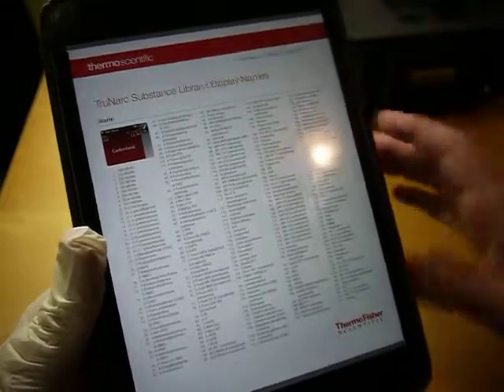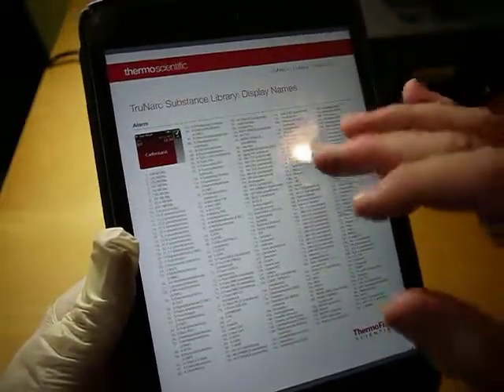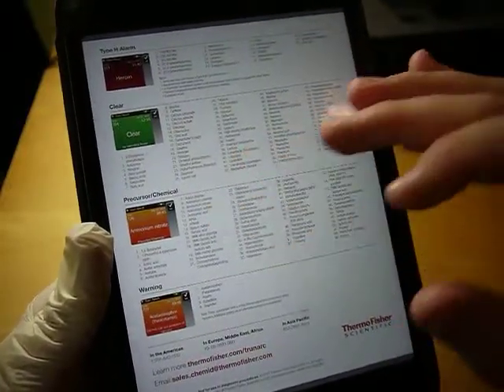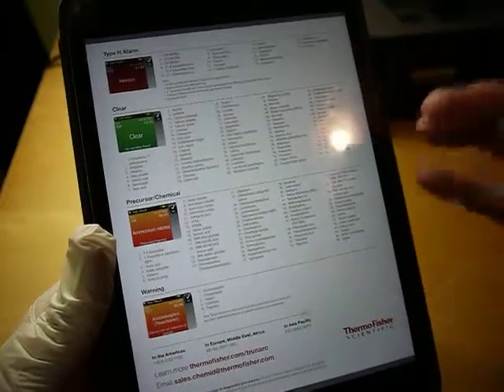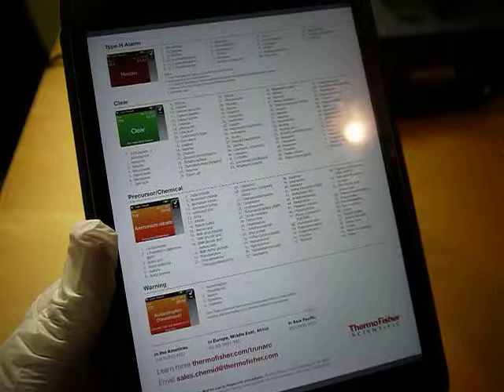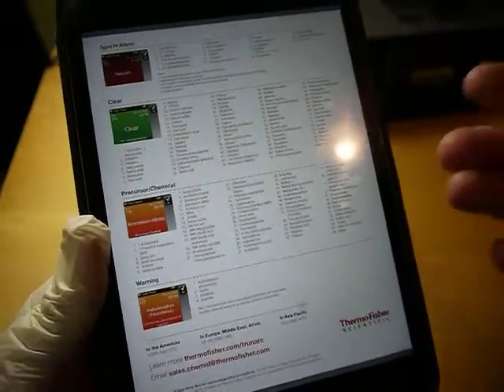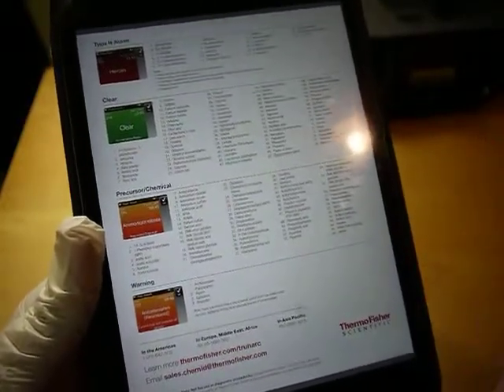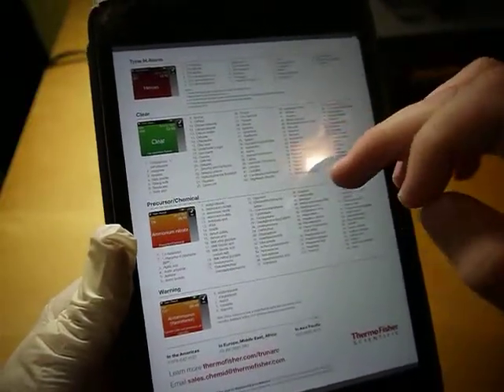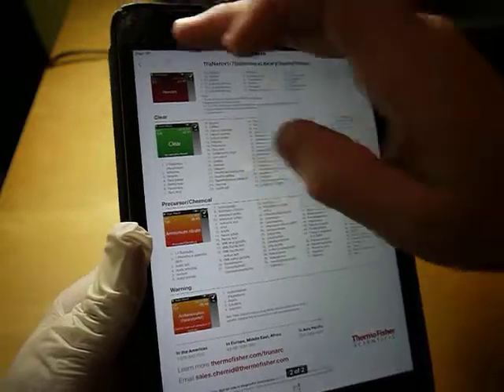It's going to beam into whatever you're sampling. We've got all these different drugs here — things like precursor chemicals and other things it'll pick up. If something is not on the list, it's not going to guess at it or try to identify it. It won't tell you something that's not in this list. What you're looking for has to be on this list, and it does cover a lot of the drugs that police and people like that are trying to find.